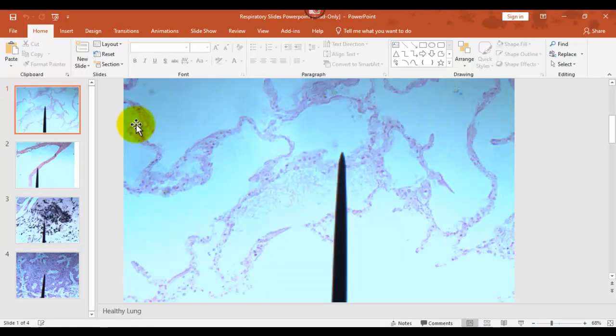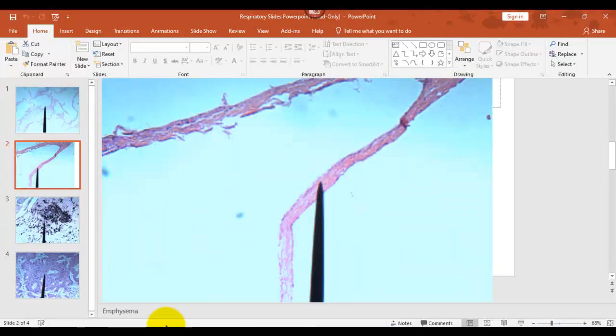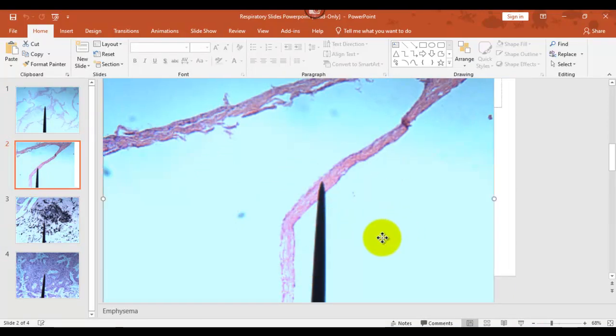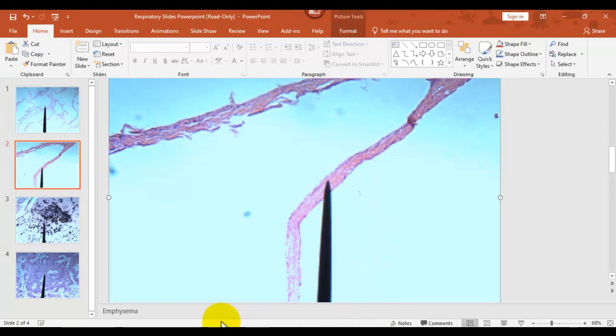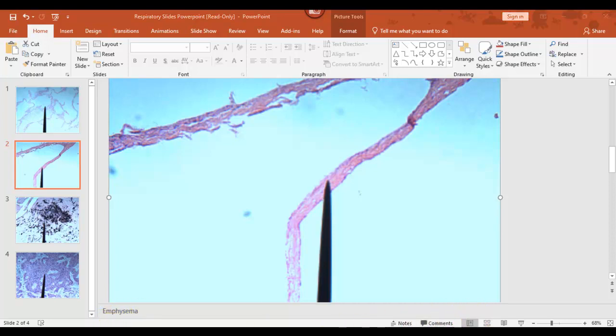Everything's clean. You'd have normal gas exchange occurring here, person would have normal amount of breath. Normal healthy lung tissue. Now our first disease state, this is emphysema, and you can see in the bottom corner it's labeled as emphysema.